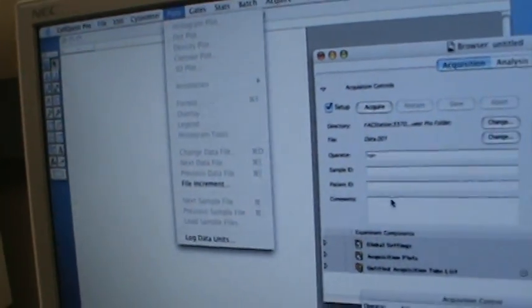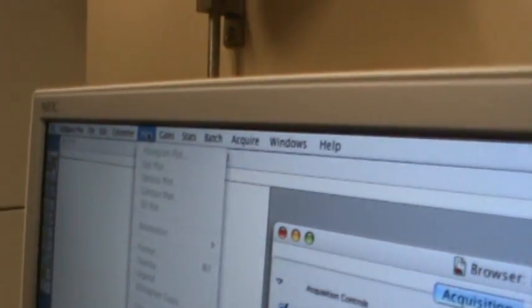The channels? FL1 and FL. It's probably two. Yes, it's actually 2 is orange. Okay. Yeah, 3 is red, I guess. Yeah. We're going to pull down everything.